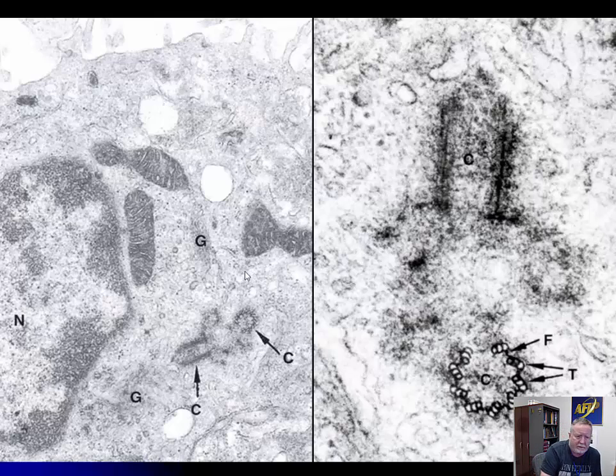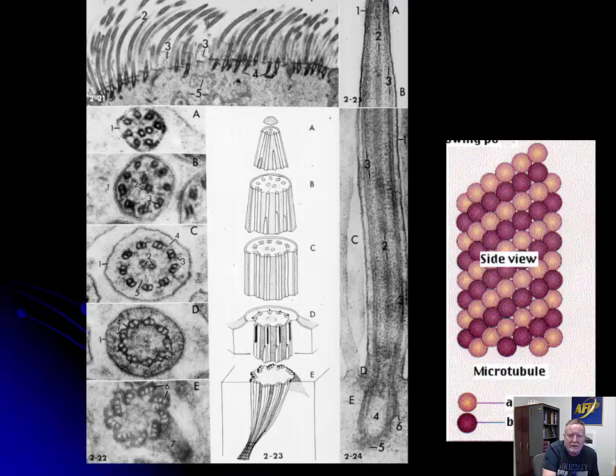there is a structure at the bottom of every cilium, which is known as a basal body. There is a condensation at the bottom, diagrammatically. Well, here's one right here, and it's known as a basal body, and essentially anchors the cilium and has a function in motility.